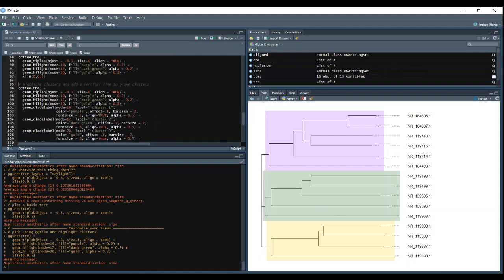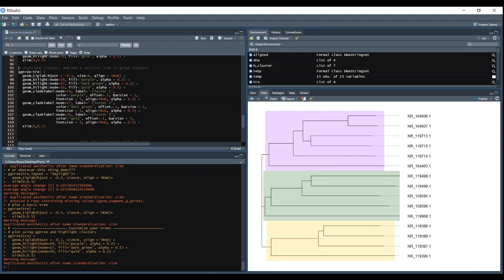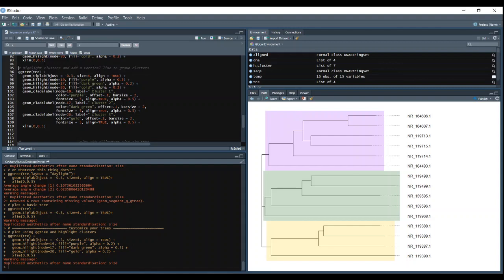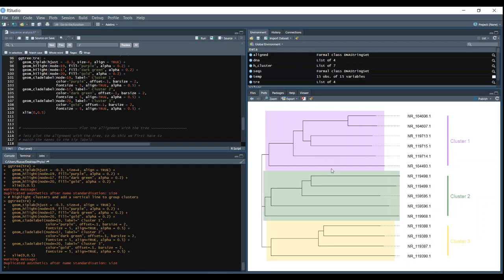You can also add clade labels. So this will put a vertical line with a label. So let's call it cluster 1, 2, and 3. So you can differentiate between different ITS sequences that may have come from different countries or some that have come from the same country and you want to just decipher which geographic region has the most differences or which have the most similarities.